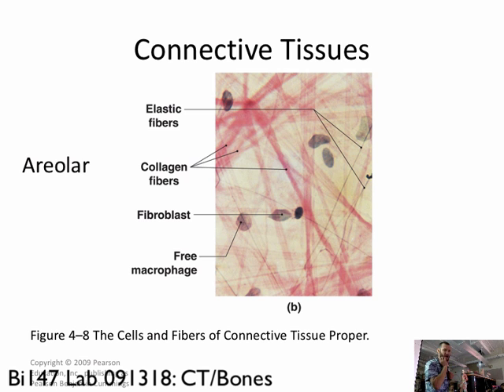Next. Okay, so let's actually talk about areolar tissue. Now get your slide in focus. Where are we at? Are you guys at the 10 or the 40 there? See what you see. Tell me what you see. Do you see something reasonably like this? Yeah, take a look at it. Let me help walk you through what you're looking at.